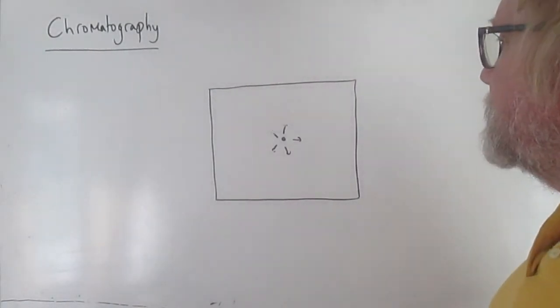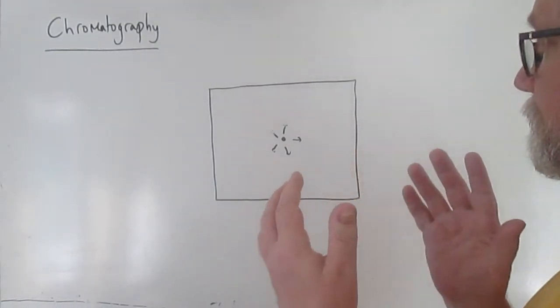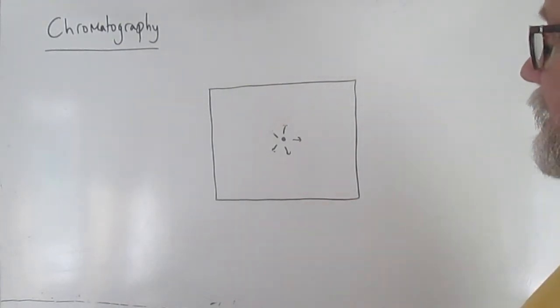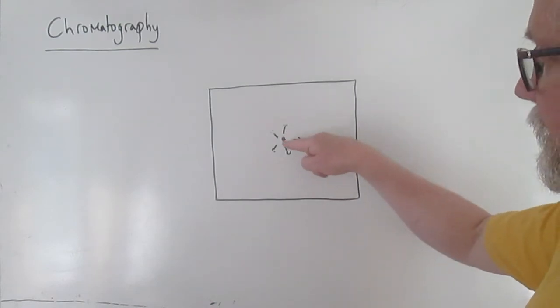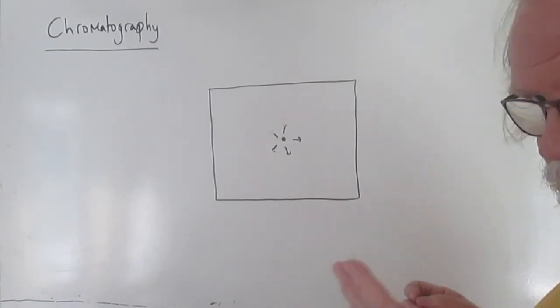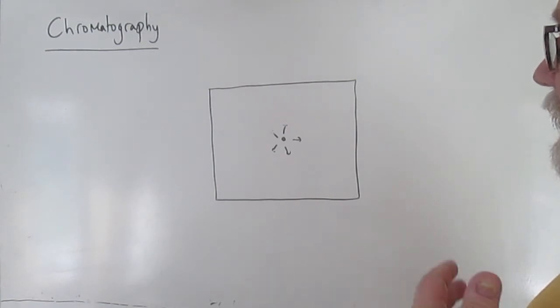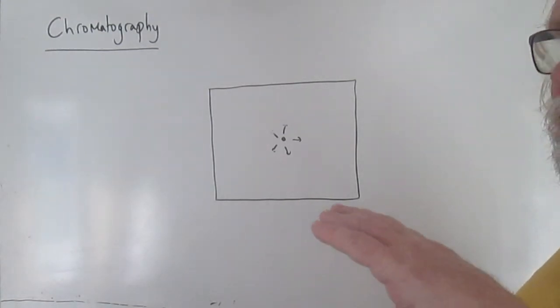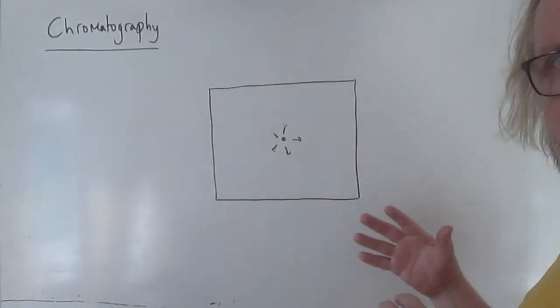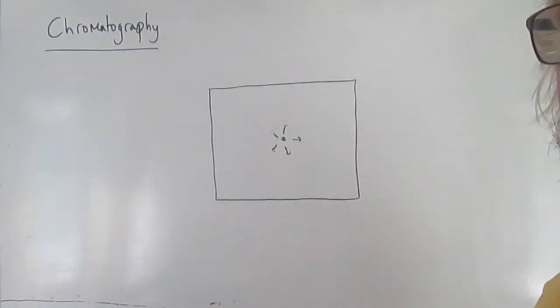But what happens in reality is that there's a competition, because the material that the shirt is made out of, remember, has adsorbed the materials in the spot at the beginning. That's why it's stuck on the surface. So there are some kind of intermolecular forces between the shirt and these adsorbed substances. When the solvent comes along, it's offering an alternative set of intermolecular forces between the solvent molecules and these molecules that we're analysing. So what we have is a competition.